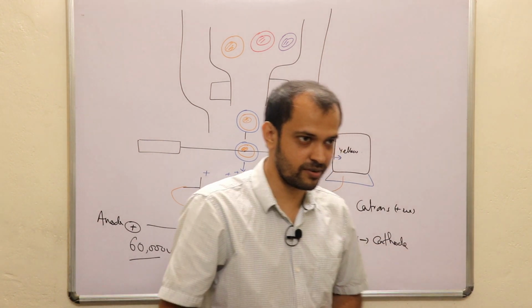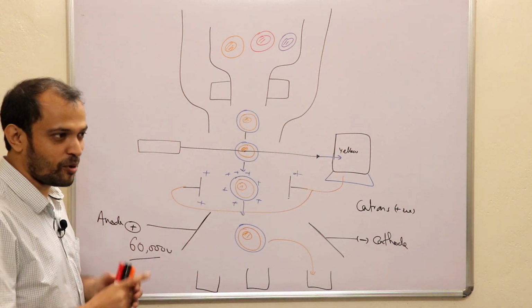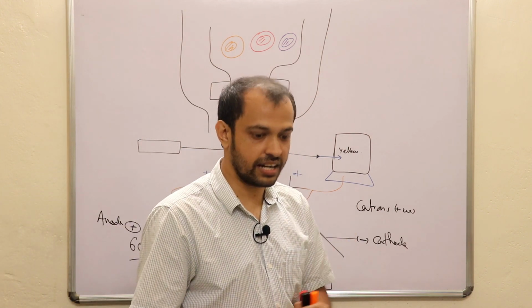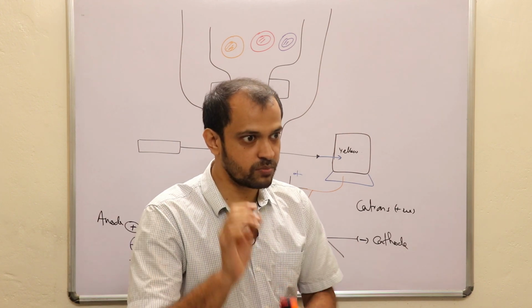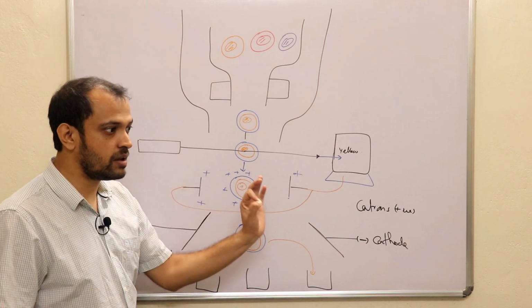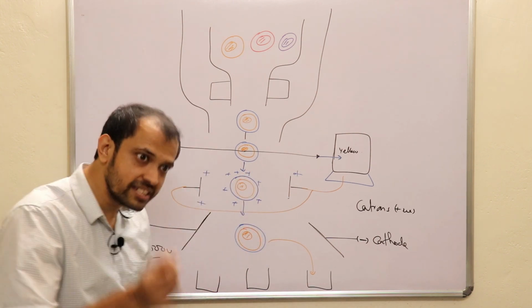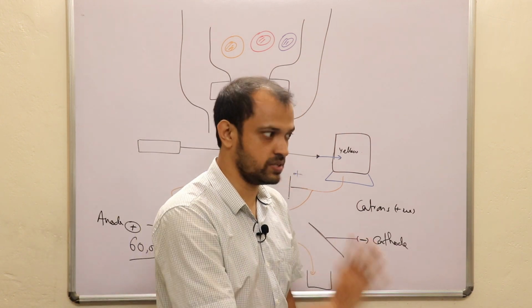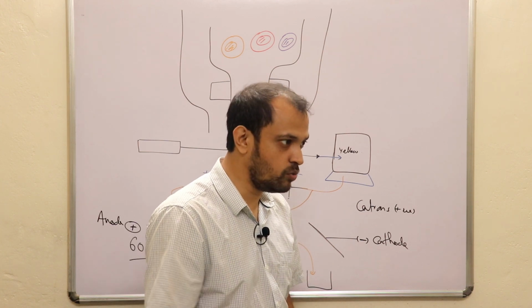Example is sitting right in front of us. But the point you need to understand is how a cell sorter knows that a cell should be charged with positive charge, or negative charge, or should be uncharged. That is my question. How will they know?